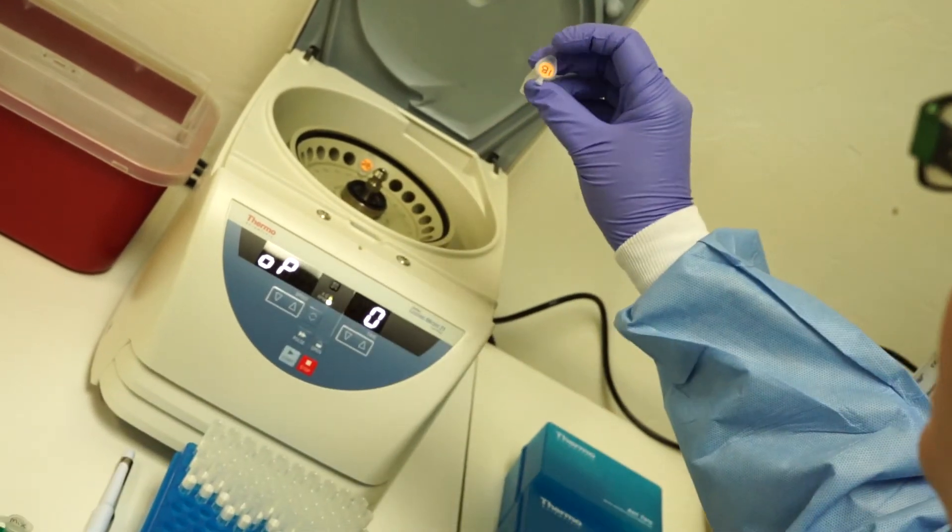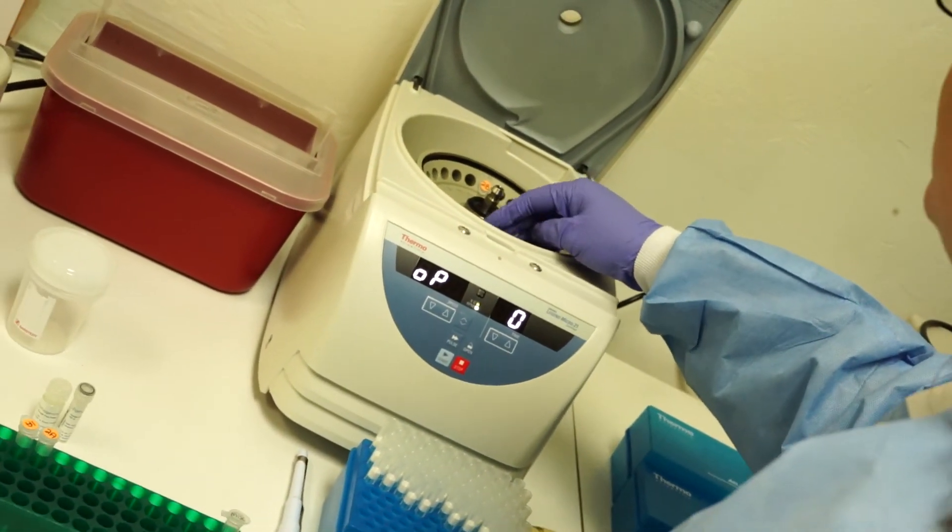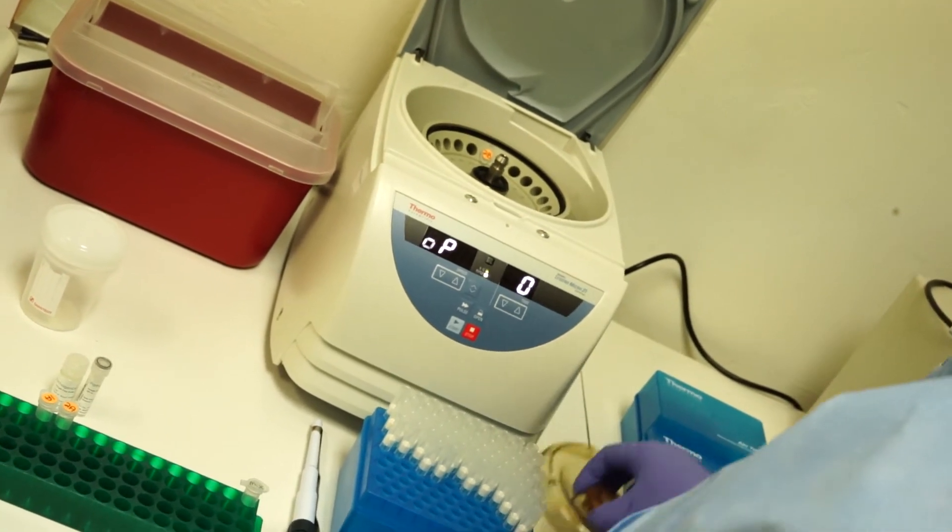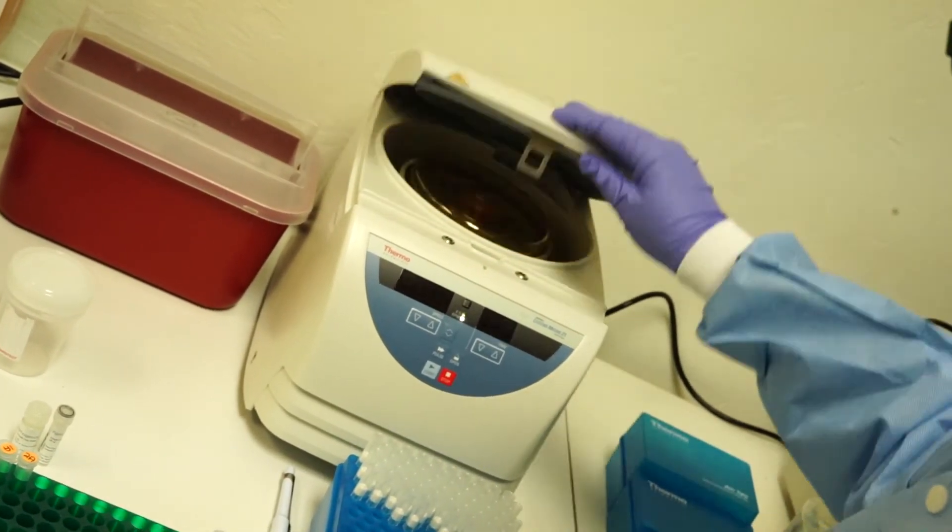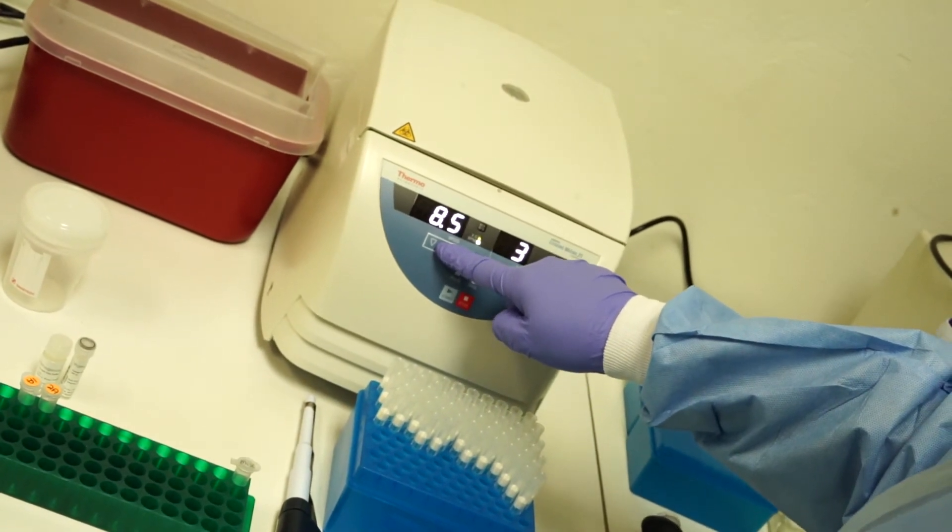Again, make sure to orient your tubes in the same direction so you will know where the pellet should be in the tube. Make sure the samples are balanced and set your centrifuge to 14,000 rpm for 3 minutes.